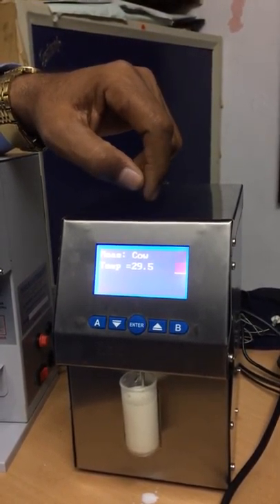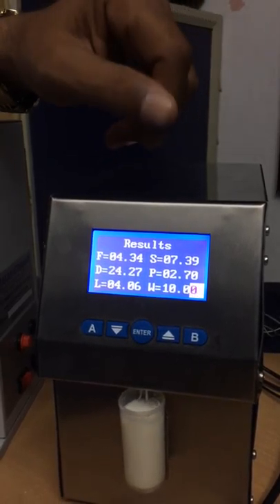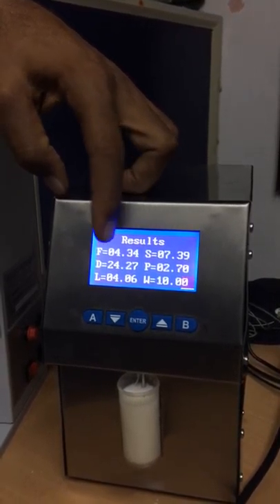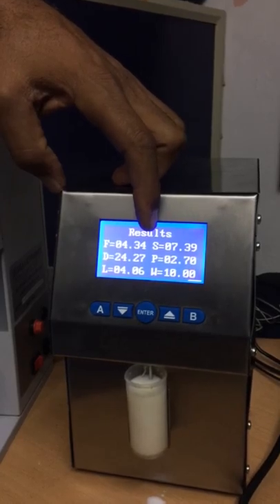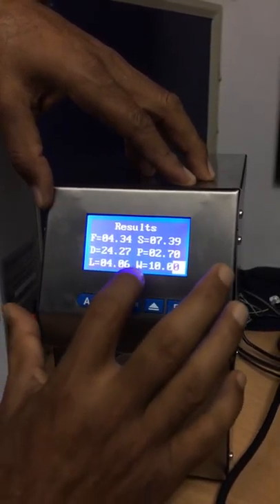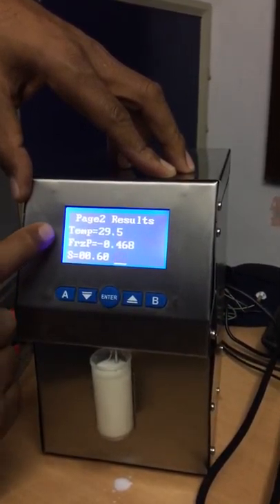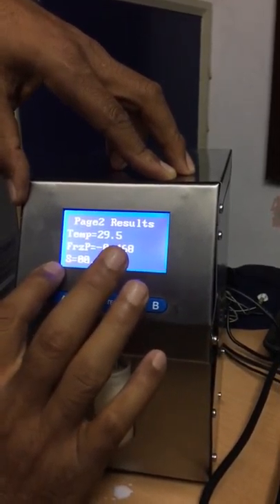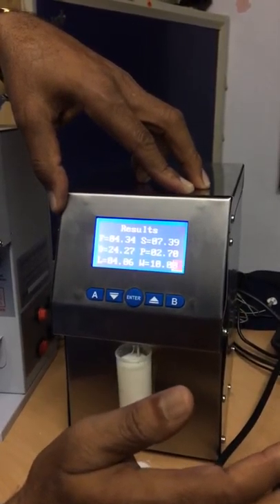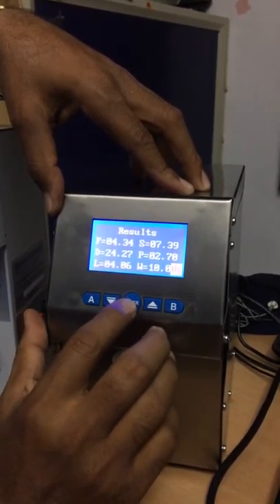Let us see the result. Now the result is already there: Fat = 4.34, SNF = 7.3, Density = 24.27, Protein = 2.7, Lactose = 4.06, Water = 10%. If you go to the next screen, it also shows temperature, freezing point, and salt. This is the main menu.